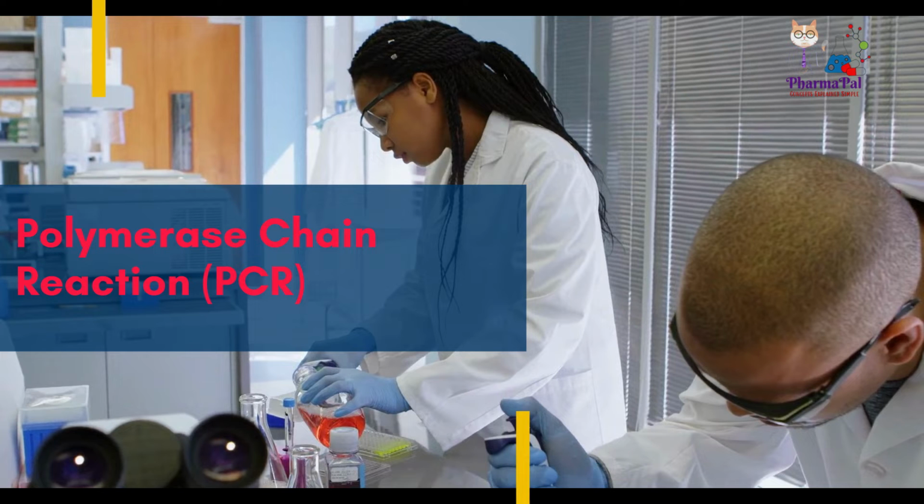Slide 5. The design of primers for PCR. When designing primers for PCR, it's important to consider factors such as primer length, base composition, and the 3' end stability. These factors ensure accurate and specific amplification of the target sequence.